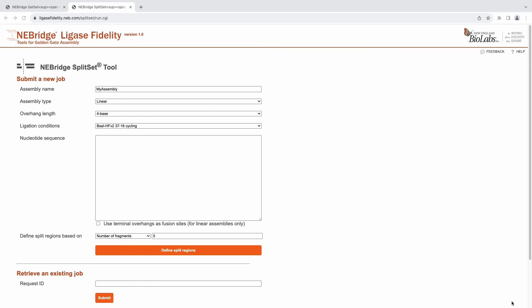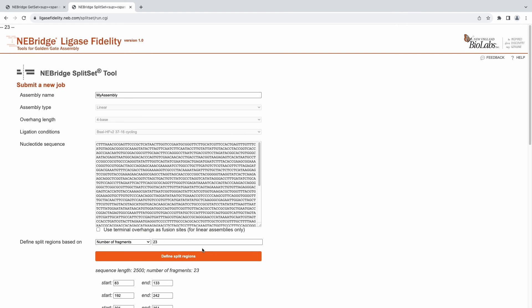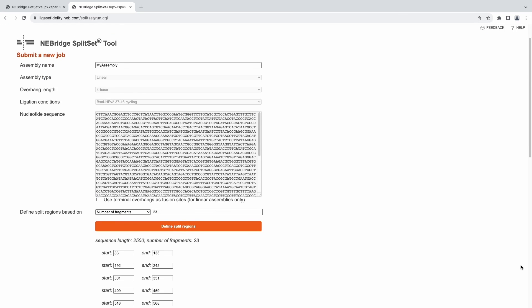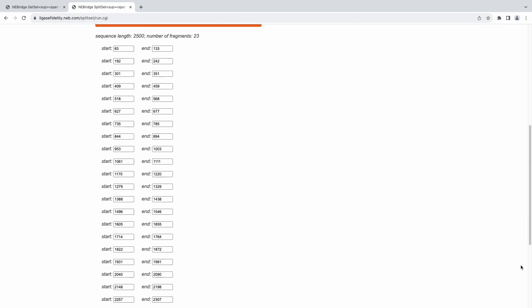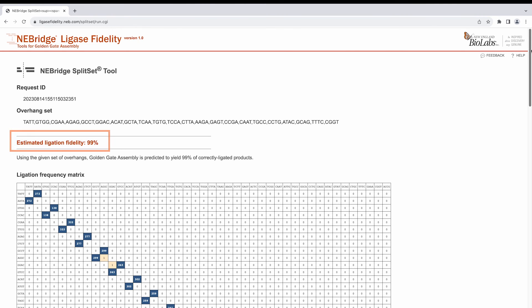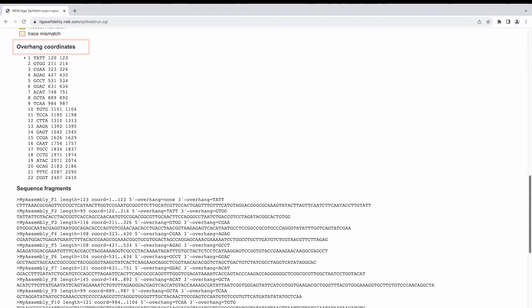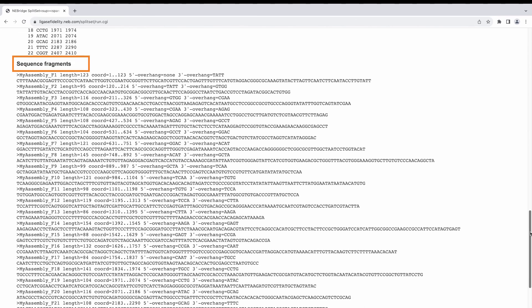For example, here we demonstrate splitting a gene into 23 fragments. We prompt Split Set with our desired Type 2S restriction enzyme, incubation condition, the number of desired fragments, and the DNA sequence to split. We can choose to exclude any overhangs or modify the regions where the sequence will be divided. In this example, the outputs are an optimal overhang set with 99% ligation fidelity, the DNA sequence overhang coordinates, and the sequence fragments.